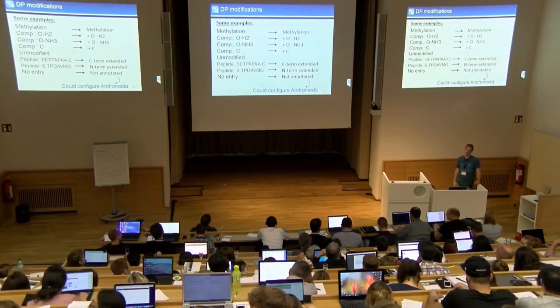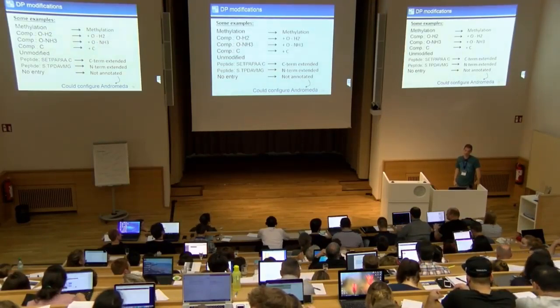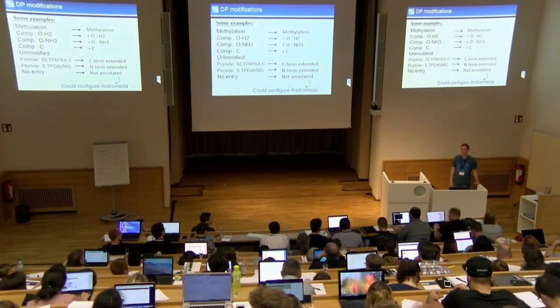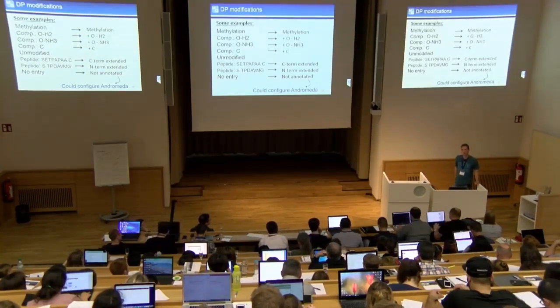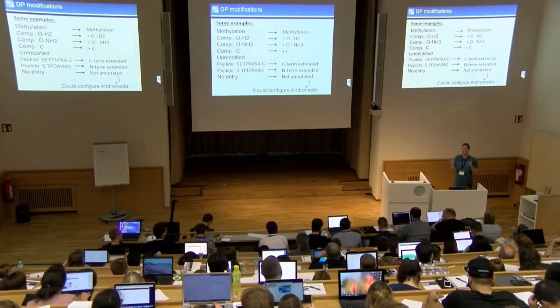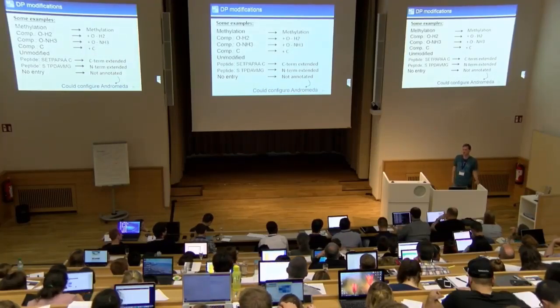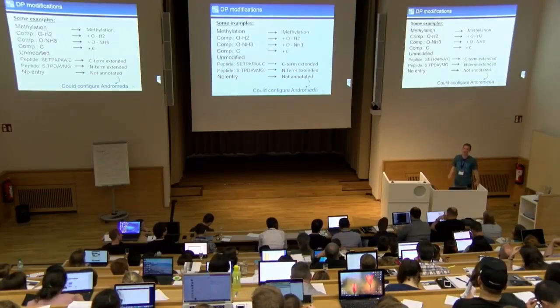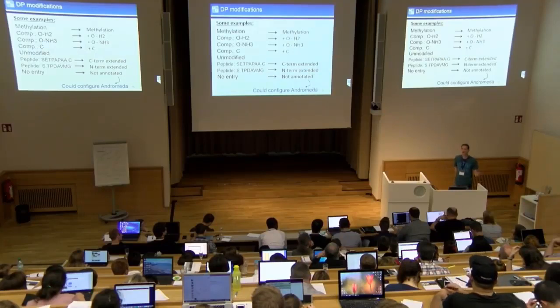If you look for a point mutation, it's not a totally different peptide, it's just one minor modification on a peptide that's known in the database. But still, that's statistically probably not giving you enough. Yeah, I think you really run into problems, because if you try to match it to everything, you will also have this huge set of decoy peptides, and you will most likely have some explanation with the decoy peptides, and then it will not pass any FDR threshold. Okay, thanks.